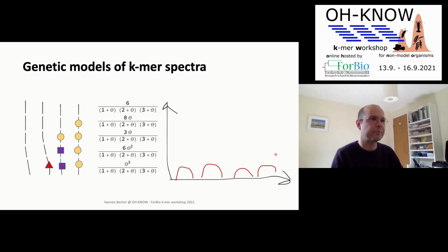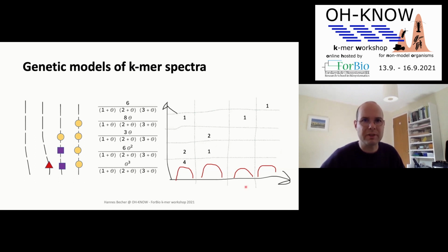So we make a little table, this 1 count to the 4x peak, and the other extreme is this, where you have a block with 4 individual different K-mers, that will contribute 4 counts to the 1x peak. And these other configurations here will contribute other counts to peaks.